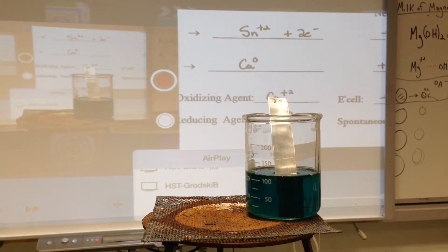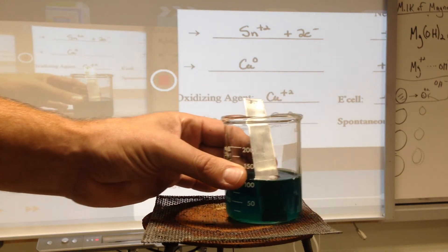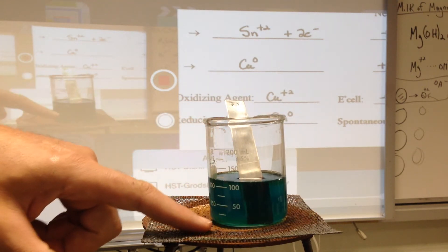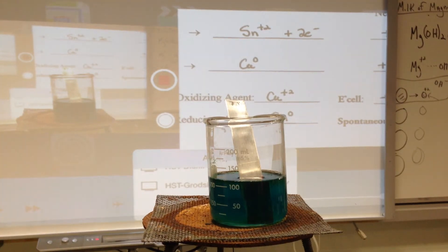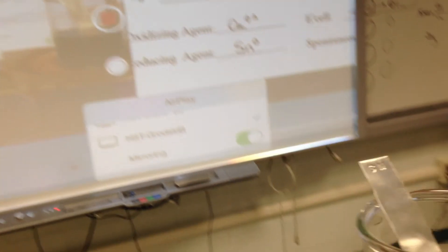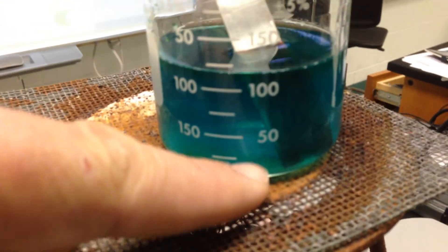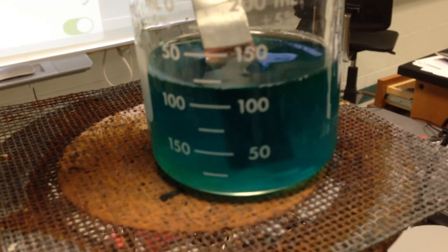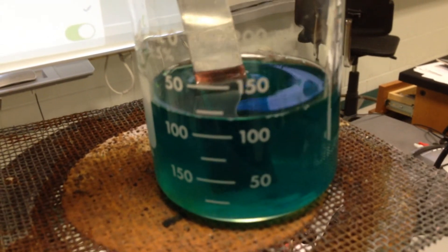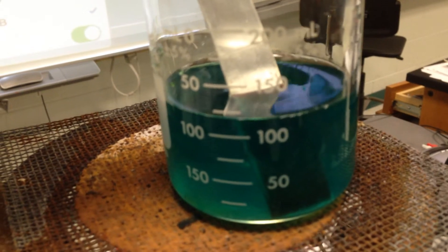you notice the tin ions are not soluble. They make a milky-white solution. Over time, what we should be seeing at the bottom of this beaker is a buildup of white. On the bottom here, you see a buildup of this white substance. That is the tin plus two ions that are appearing.